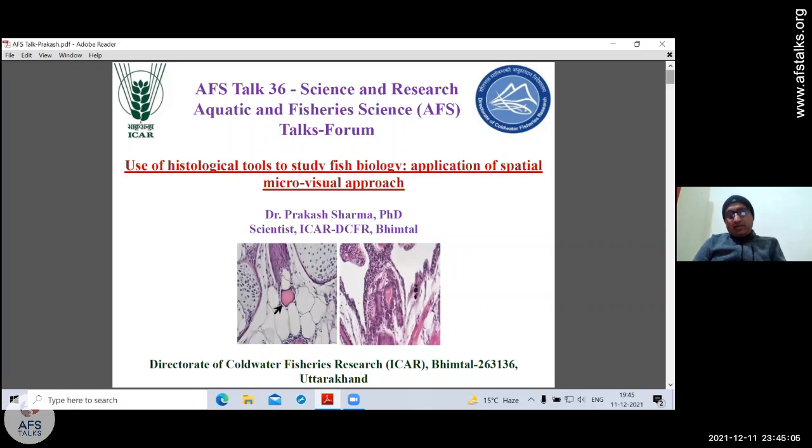And while doing my work, how I enjoyed the work was, when we slice the fish, we do serial sections, and every slice of fish is like pages of the book. And then we can read how things are happening inside. We can observe those under the microscope, and we can observe this as reading individual pages of the book.